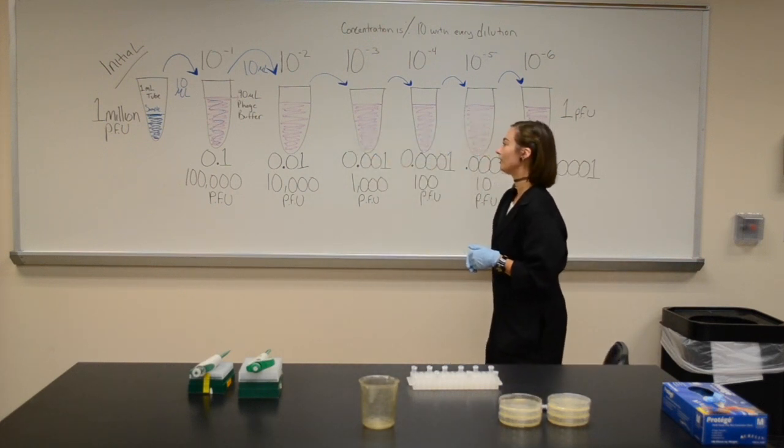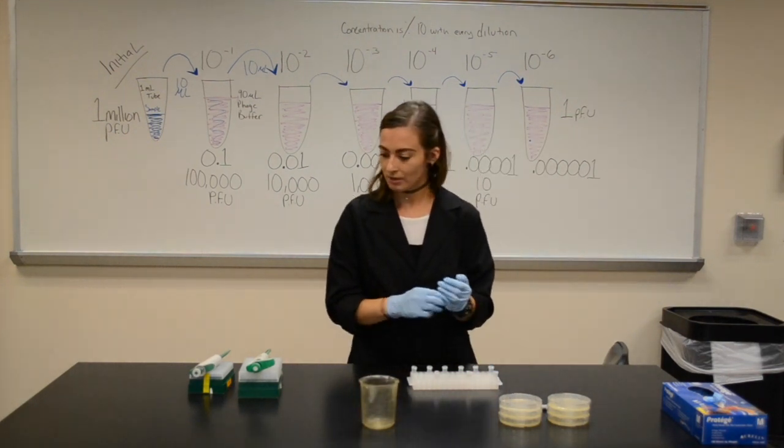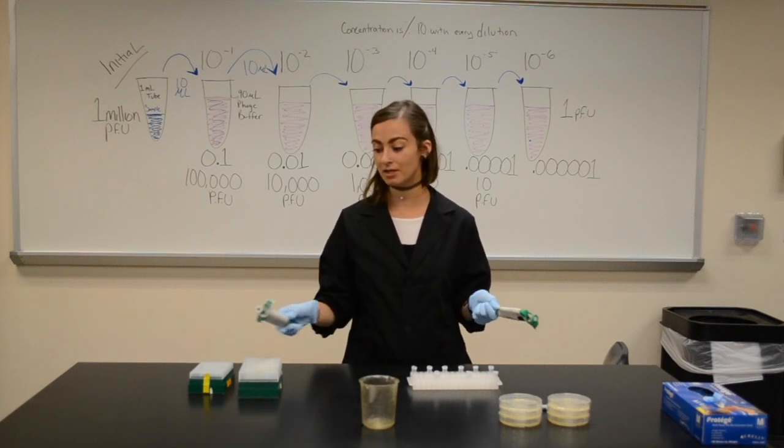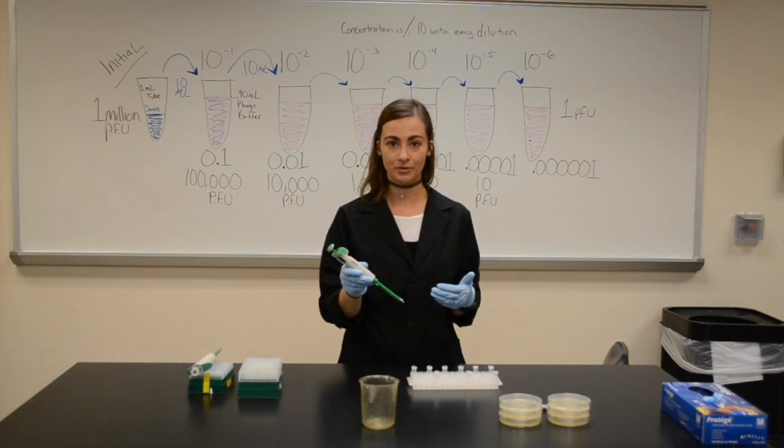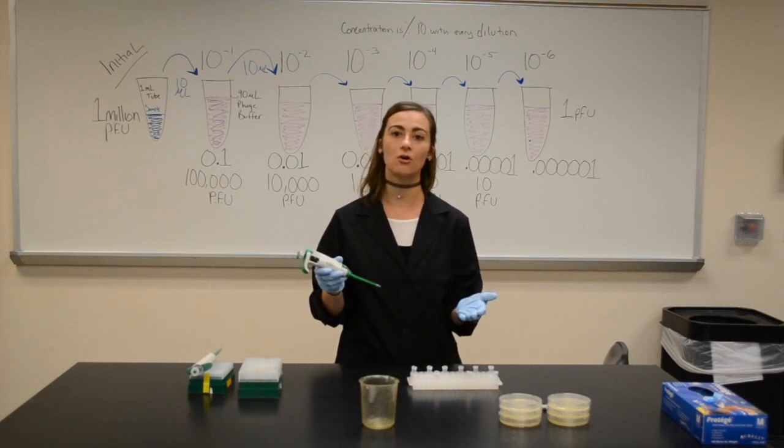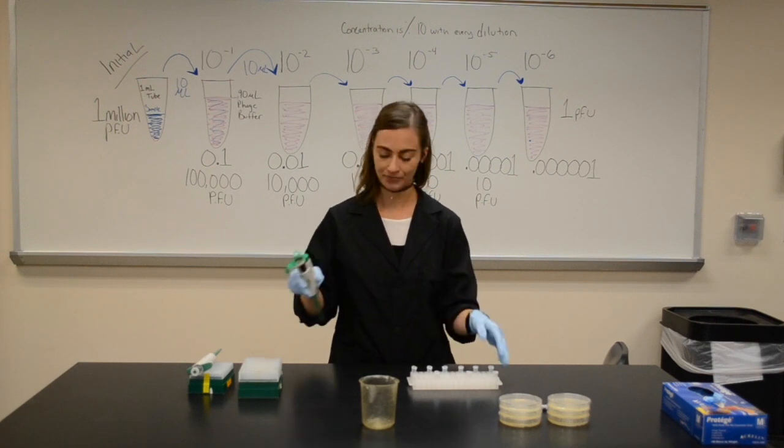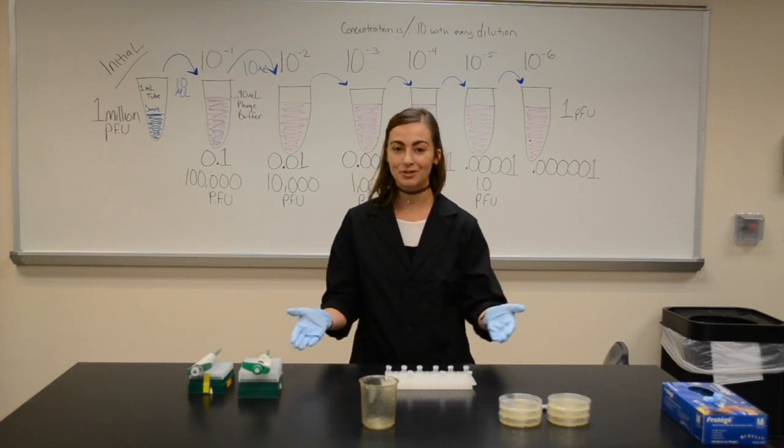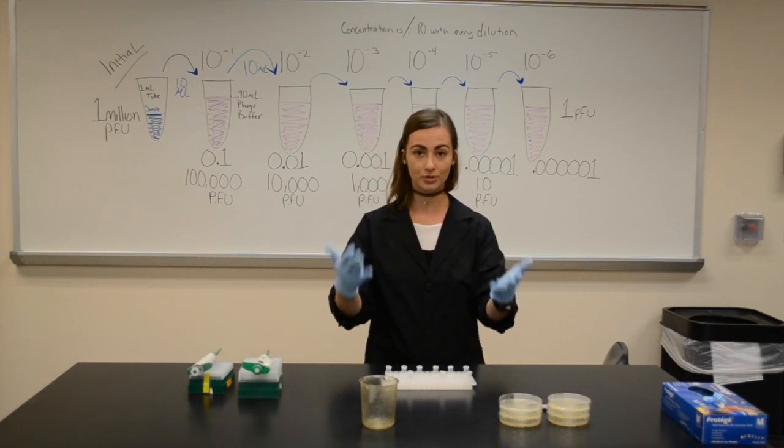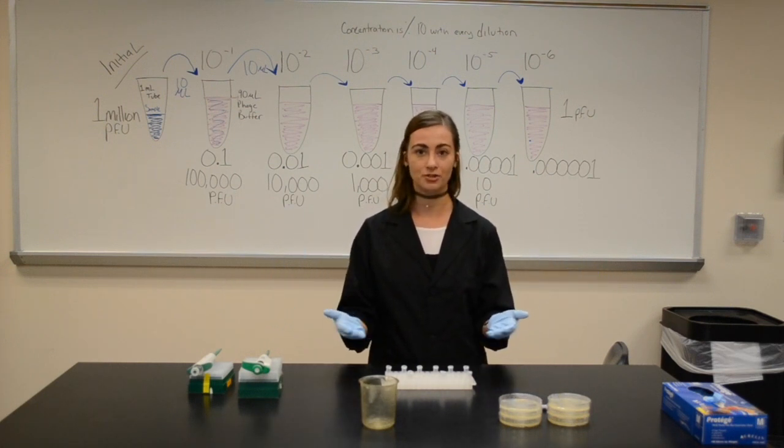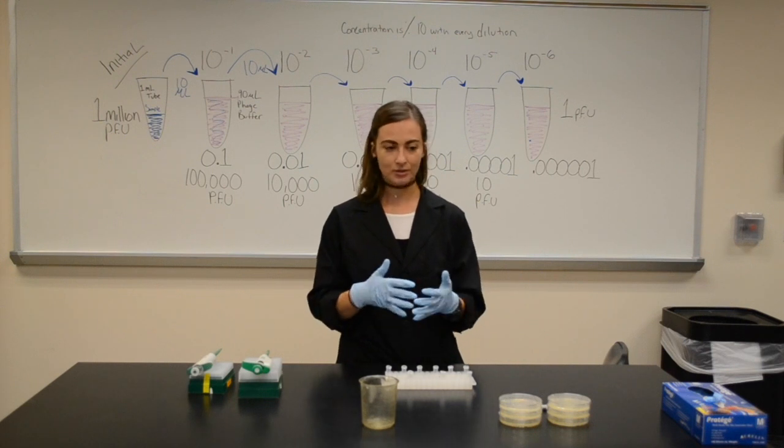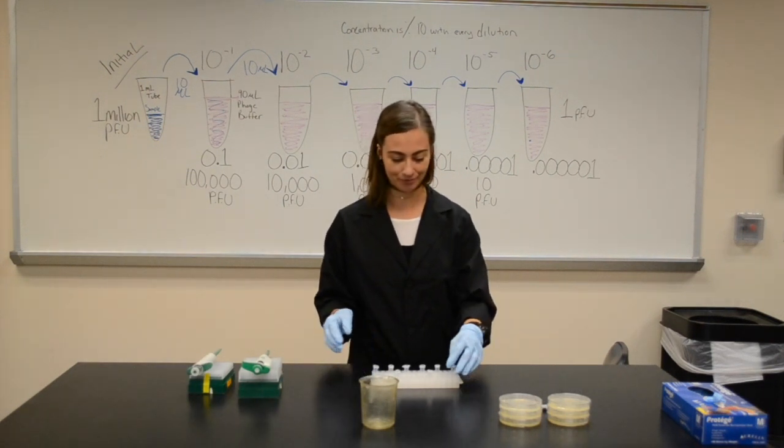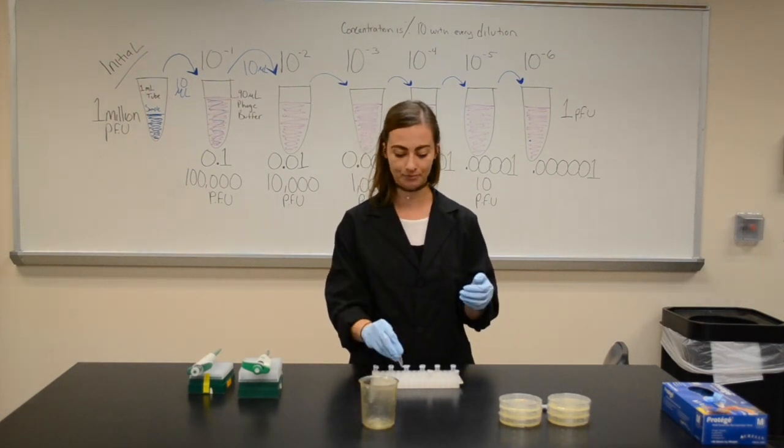Let's actually go ahead and do it. With our micropipettes, just like we kept the table aseptic and clean, we're going to wipe these down. It's just to keep the contamination low. You don't want to have anything on here that could contaminate our sample. Remember that even though I'm talking right now, while you're doing this you don't want to be talking. You don't want to be polluting your zone of silence with bacteria or debris or whatever else that might be kicked along in the breeze.